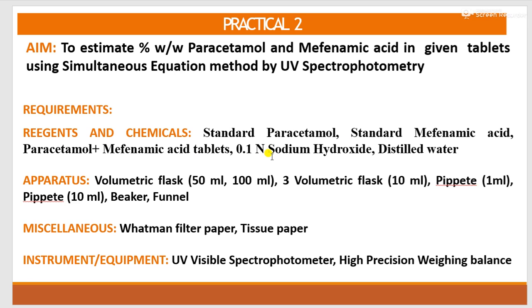The reagents and chemicals required are standard paracetamol, standard mefenamic acid, tablets containing paracetamol and mefenamic acid, and 0.1 normal sodium hydroxide. The role of sodium hydroxide is to dissolve the standards as well as the sample, and distilled water is used to prepare 0.1 normal sodium hydroxide.